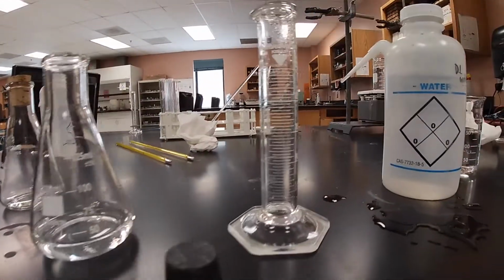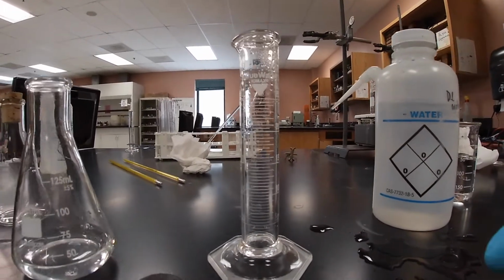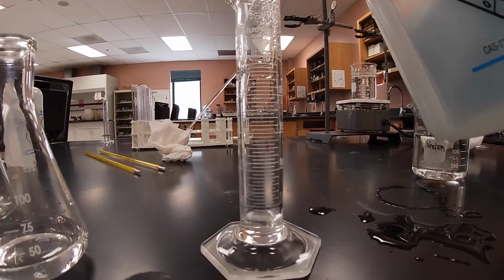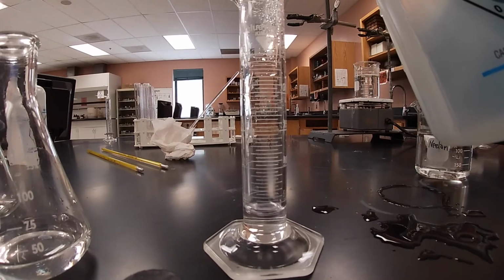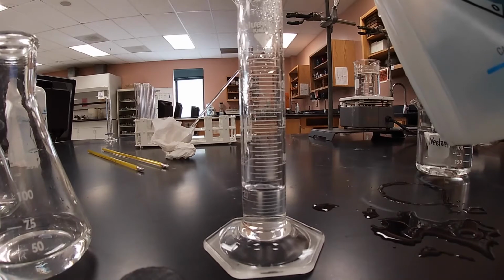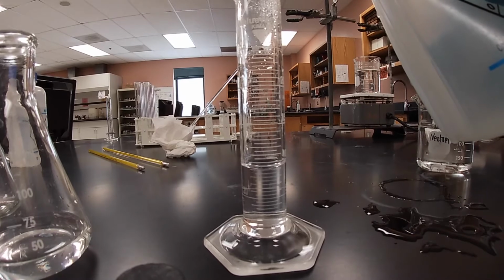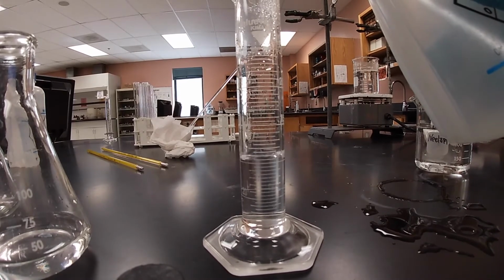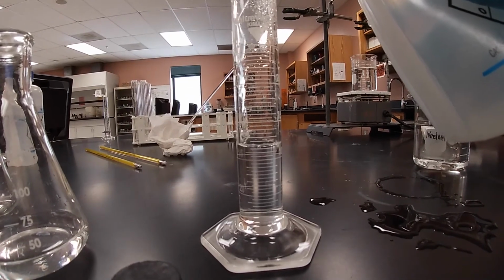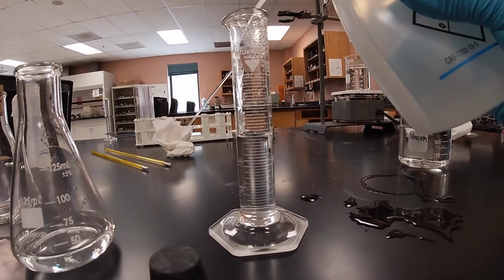Okay, so I'm going to do this process again, and then we'll measure out the tap water as well. So we're almost there.